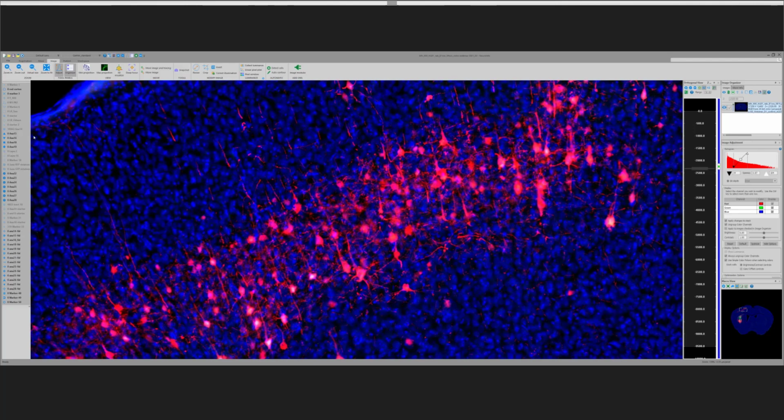So in this program, we can also detect the individual neurons. I've done this before, and we're going to have a webinar on this separately to show that. But we can see the neurons. See, there are pyramidal neurons in the cortex projecting to the striatum.